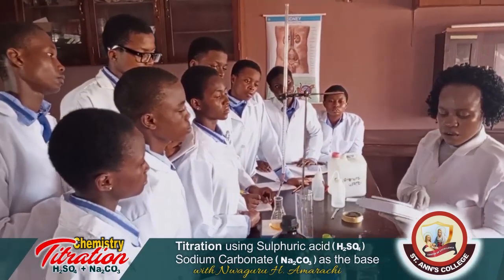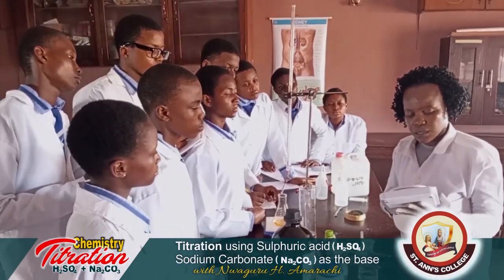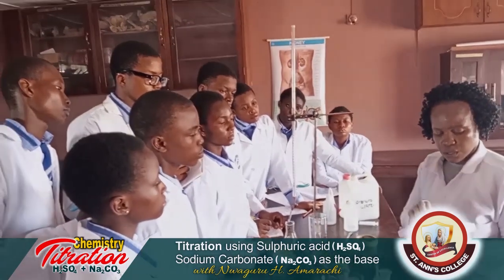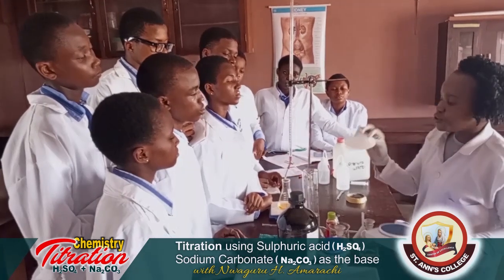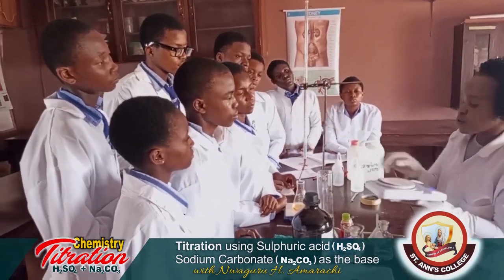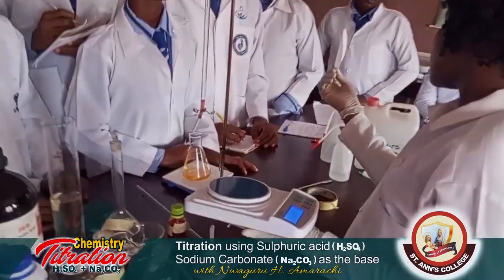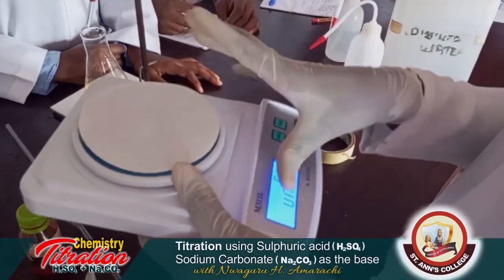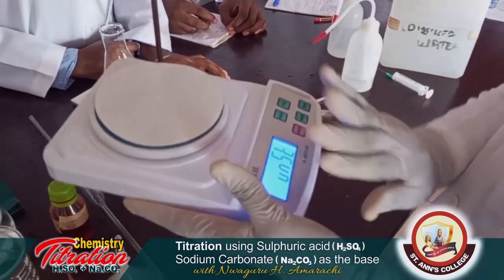Now there is a knob here that switches it off and on, and for you to set the correct mode of the weighing balance, you use your filter paper and place it on top. Make sure you zero, because this filter paper has its own weight. So when you place it, you tell the weighing balance to make it 0, so it goes back to 0 value.